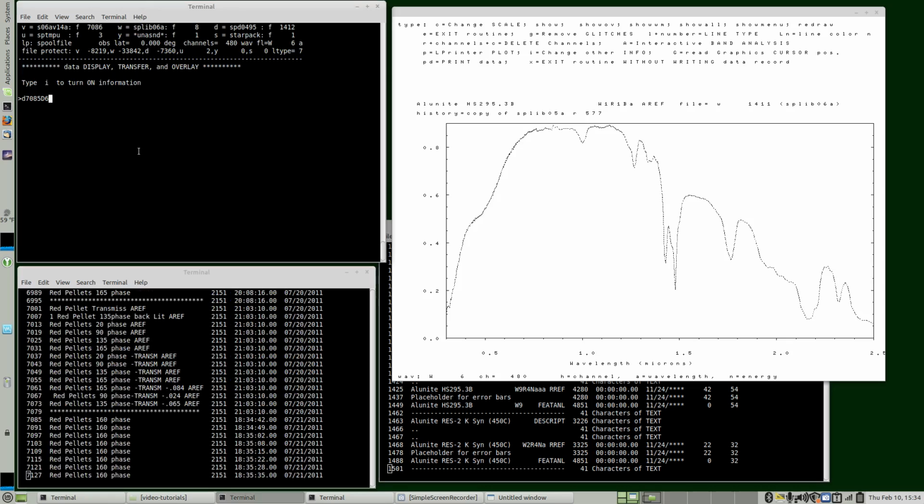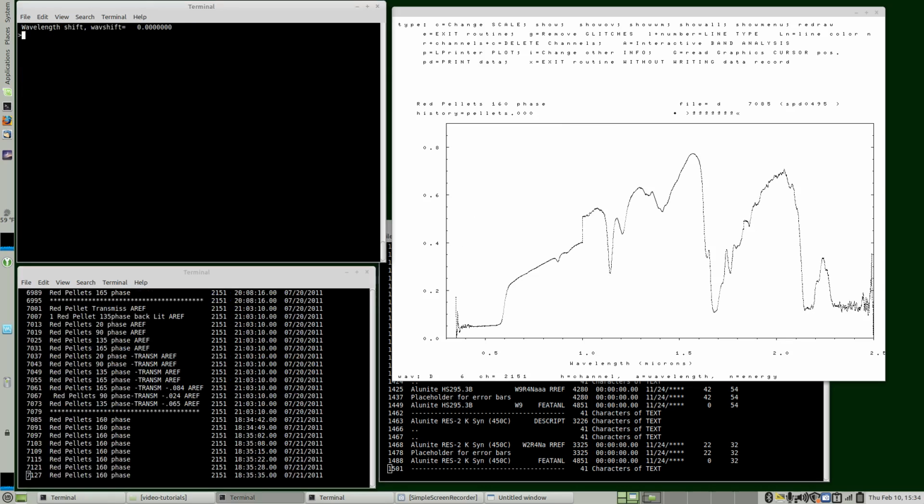Okay, so we can look at one spectrum here, and that's it. The spectra, since they're the individual measurements, don't have error bars on them. This is a little plastic pellet, so these are aliphatic hydrocarbon absorption bands from single bonded C bonds.